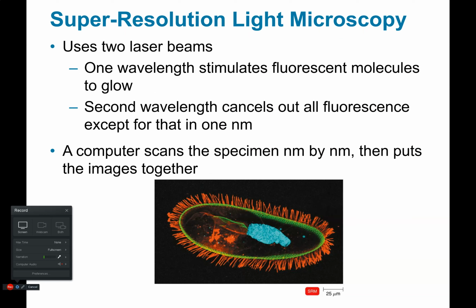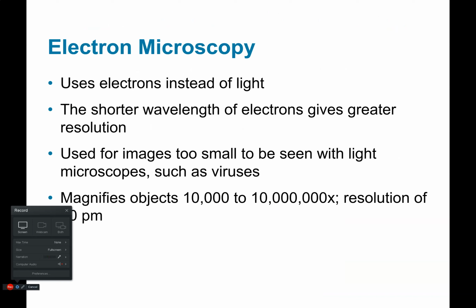And then, oh, that one might have been out of order, because now we're going back to light microscopy. Super resolution light microscopy. I don't think I have this one on the study guide. This one is only in our newest edition of the book, the 13th edition. So if students are using an older edition of the book, they wouldn't see this in their chapter. And so I did leave it off of the study guide for that reason.